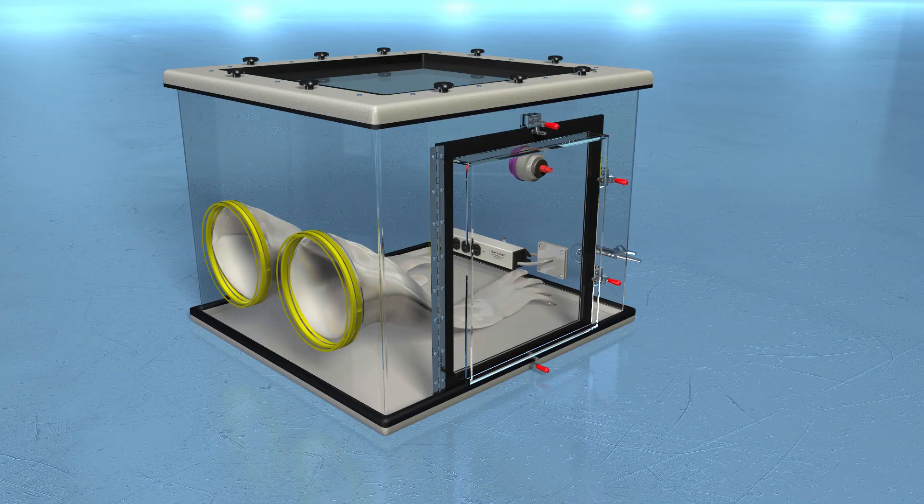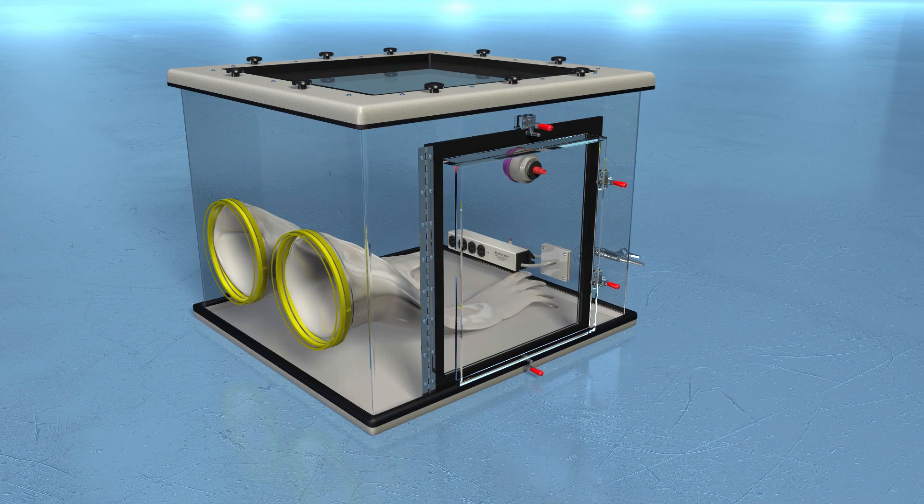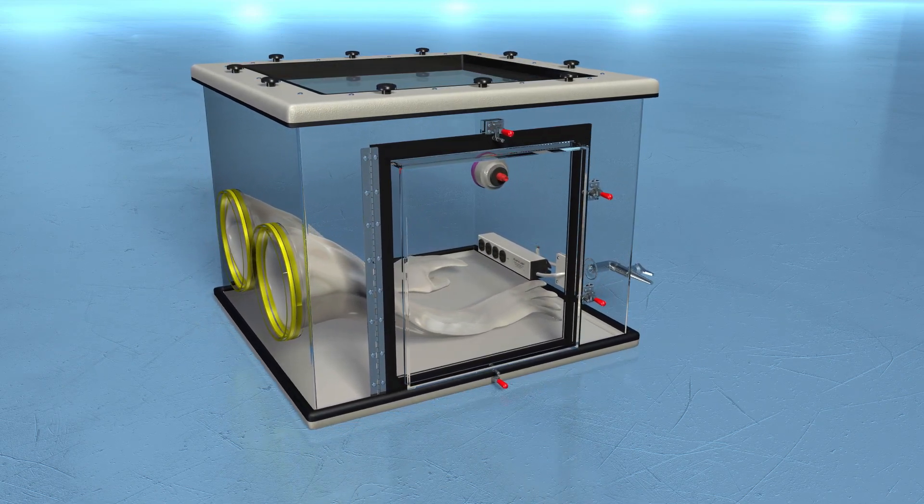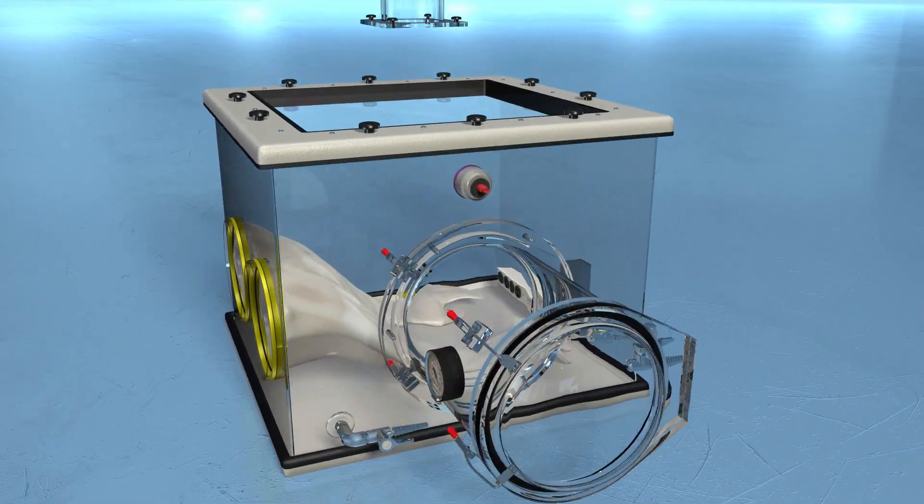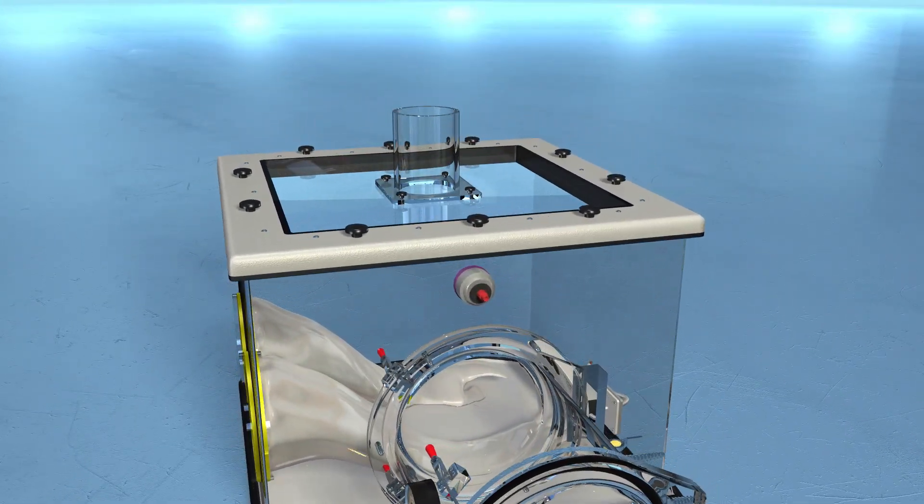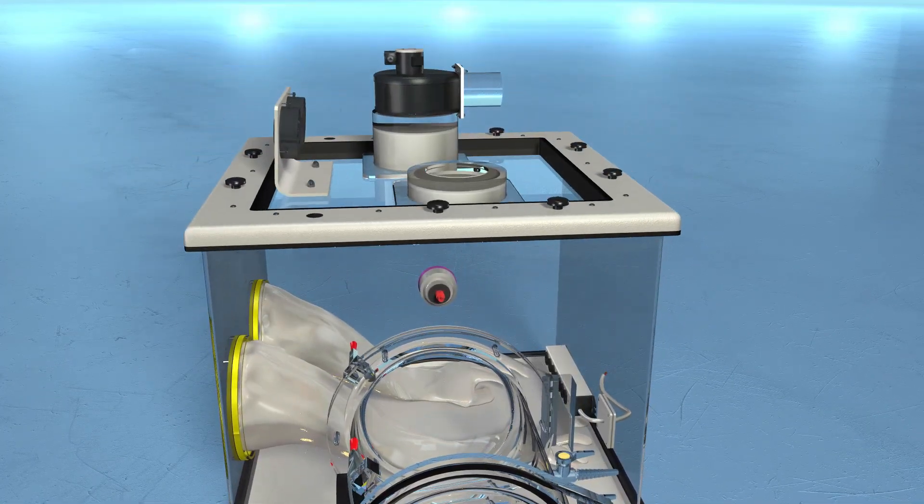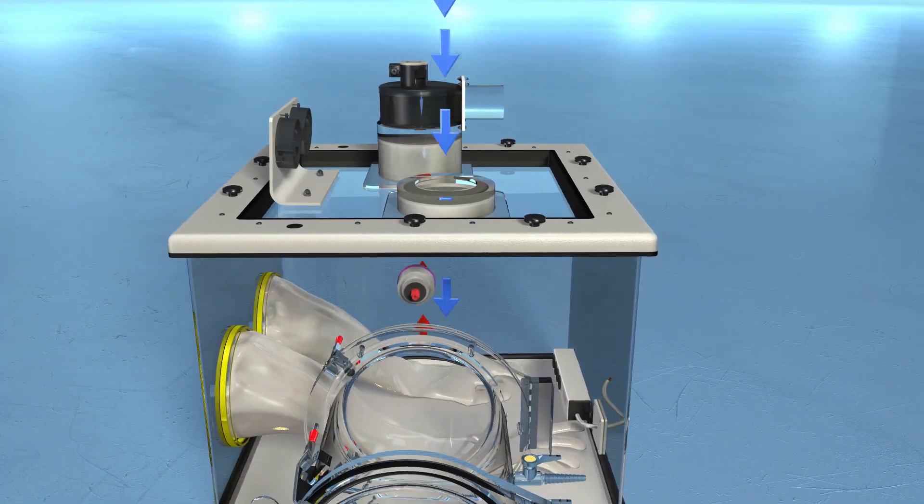The 830 series can also include these popular accessories. Flat access door mounted on side or on the front. Top mounted vent for house exhaust hookup. HEPA filtration systems can also be added to the 830 series glove box.